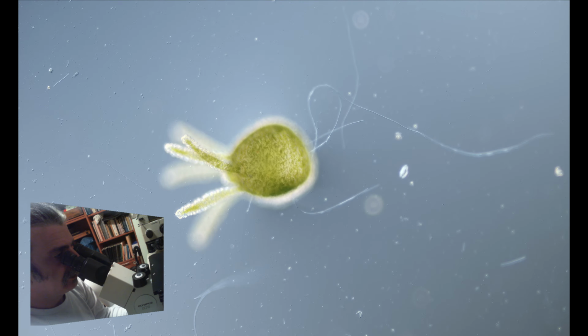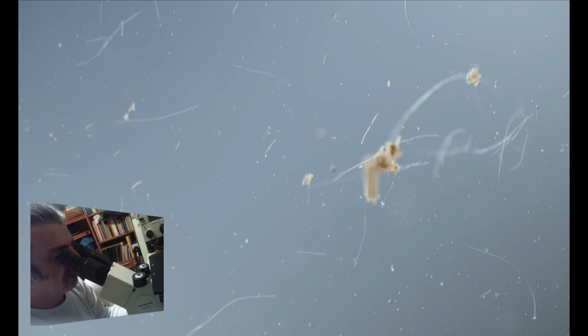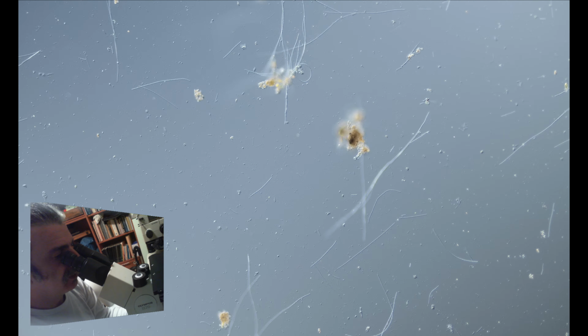Loxophyllum, hydra. This is just a small sample from that pond. It's actually one of the first ponds I was taking samples from, but the sample is a few days old now.